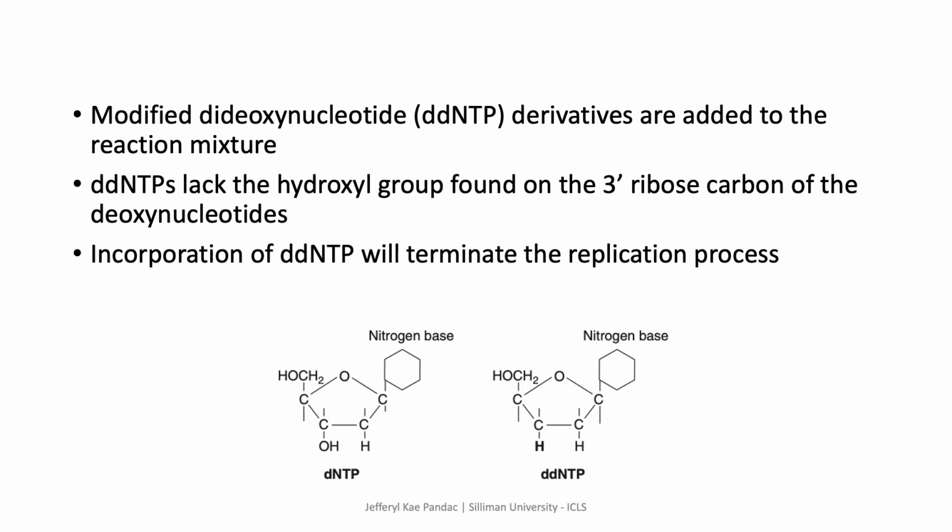dideoxynucleotides or ddNTPs. Just as in the in vivo DNA replication reaction, an in vitro DNA synthesis reaction would result in polymerization of deoxynucleotides to make full-length copies of the DNA template. For sequencing, modified dideoxynucleotide or ddNTP derivatives are added to the reaction mixture.